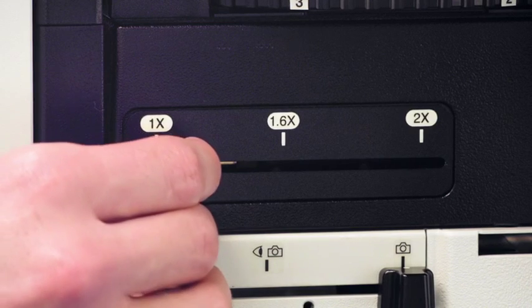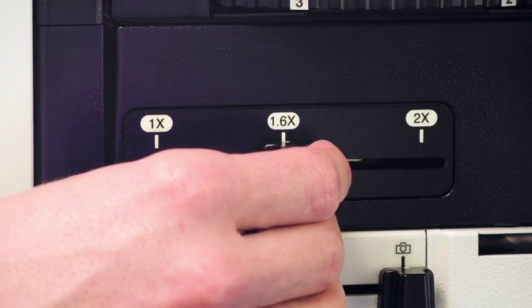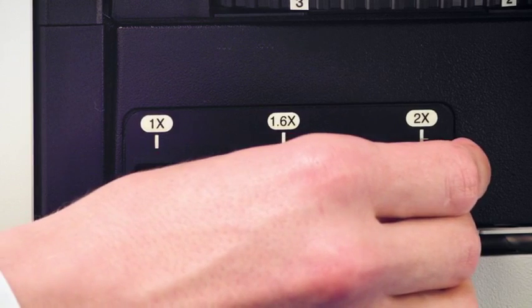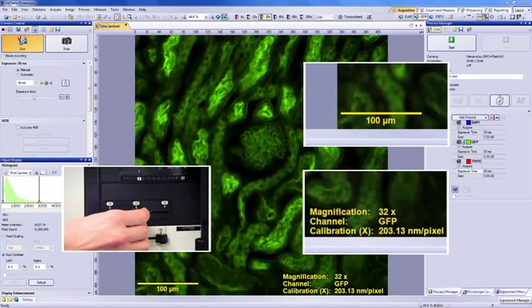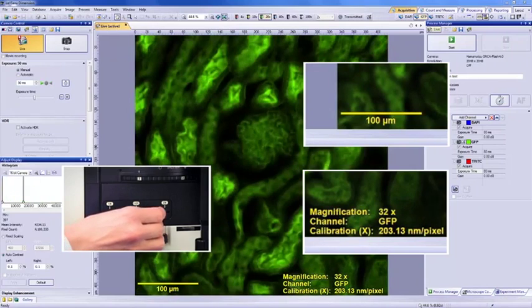An optional magnification changer with 1.6x and 2x lenses provides a similar benefit. The added magnification is saved in the scale bar and pixel dimensions without any input from the user.